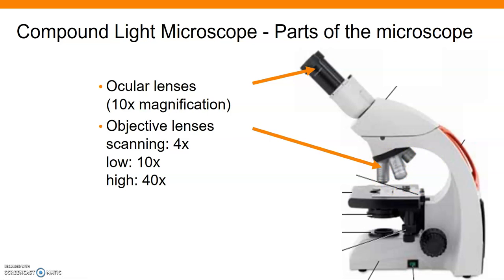We have another set of objectives here that are going to magnify even more. On our microscopes we have three. The three objective lenses that are attached to the rotating nose piece here will actually turn. The shortest of the three is called the scanning objective. This is a 4x magnification. Then there's a 10x, which is the medium-sized objective, which is the low power. And then we have a high power on our microscopes that goes up to 40x. When you take your microbiology class, you will have a higher power, 100x, what we call oil immersion. We will not be doing that in our class this semester, but you will see that as you move into your further classes.